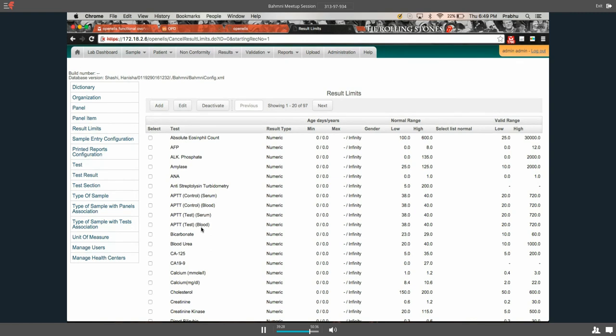I had just one more question around what Vinay mentioned. Vinay mentioned certain things can be configured in OpenMRS and they flow into OpenELIS. Is there any configuration in OpenELIS that needs to flow back into OpenMRS? Like for instance, if we add a test, it doesn't go back into OpenMRS, right? It'll stay in OpenELIS and it wouldn't be recommended in that case. Just wanted to clarify that.